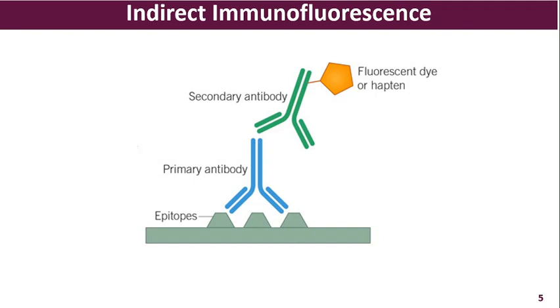Primary antibody could be obtained from the source, that is the person who might have produced the antibody against the infection of a bacteria, or who has the antibody against certain cell antigens. And after adding the primary antibody, the preparation needs to be given a wash. Since the antigen antibody interaction is very strong, the primary antibody does not get washed off.